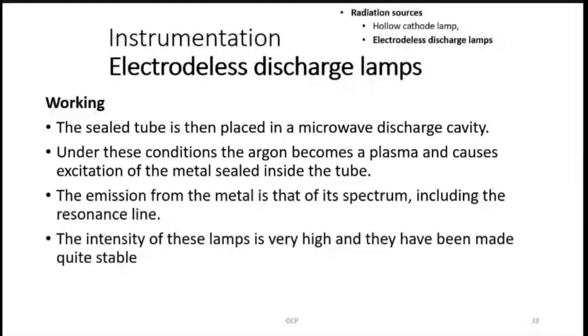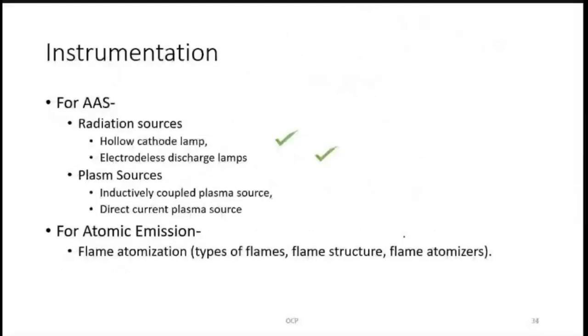Okay, now we are done with radiation sources, both hollow cathode lamp and electrodeless discharge lamp. Plasma sources we will discuss in the next lecture.